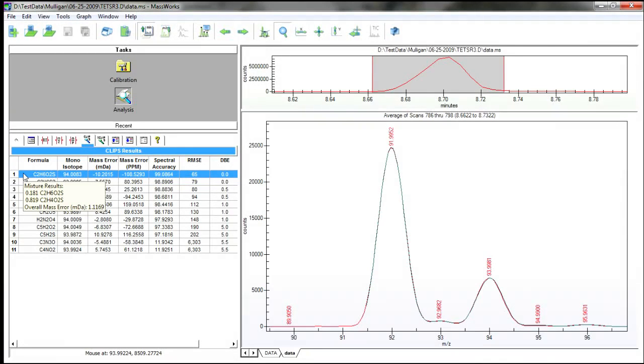This is very useful for at least the following two applications. 1. EI analysis of molecular ions, particularly straight-chain hydrocarbons, which may also lose a hydrogen during the EI process. And 2. Accurate relative quantitation of native and isotope-labeled ion mixtures, such as through deuterium labeling or radiocarbon labeling experiments.